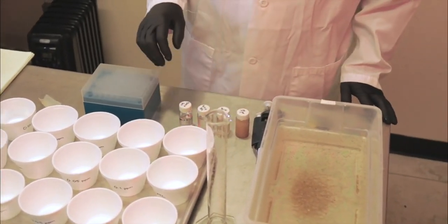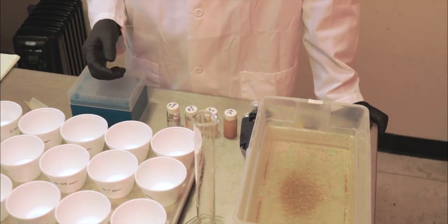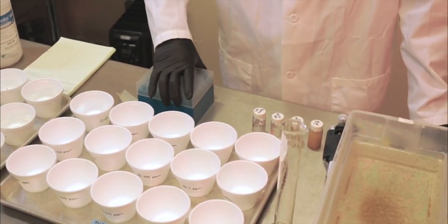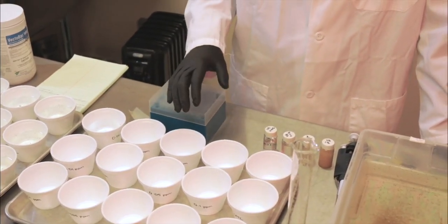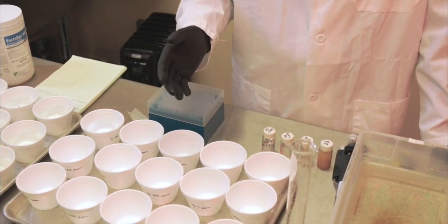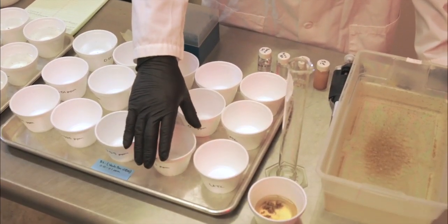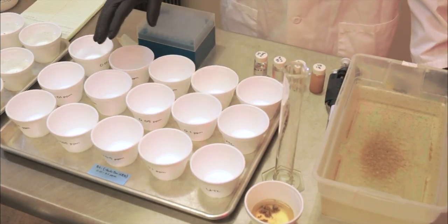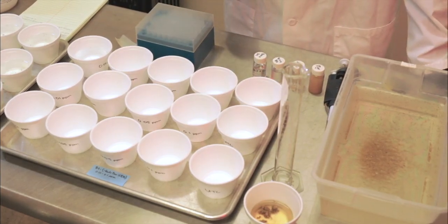And the range, how could you know what concentration will lead to 5 to 95% mortality? That is based on the literature, based on your experience. On the other hand, if your range does not give you the mortality you want, for example, at the high end you only get 10% or 20%, that means something is going on in your mosquito population. If everything is done right, the population may show some tolerance or resistance. That's something exciting. That's what you want to find out.